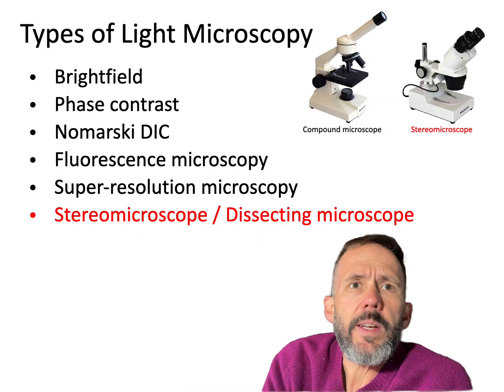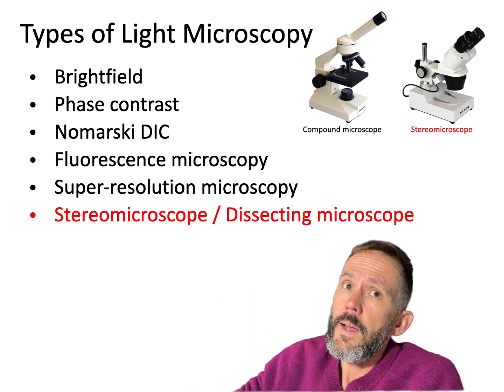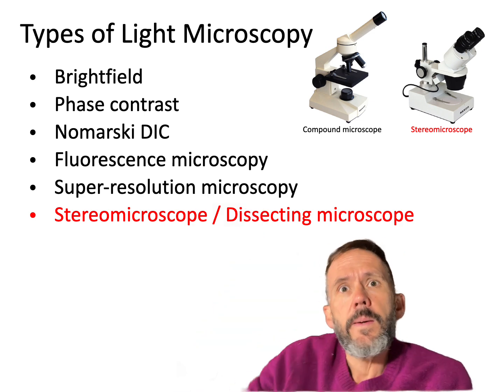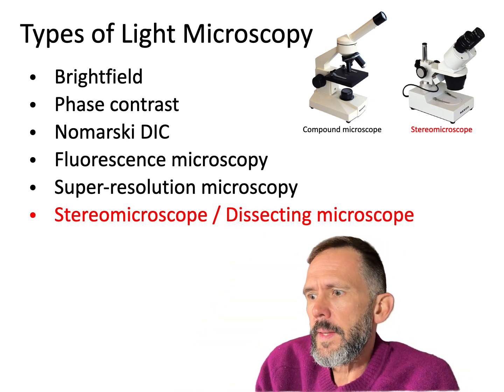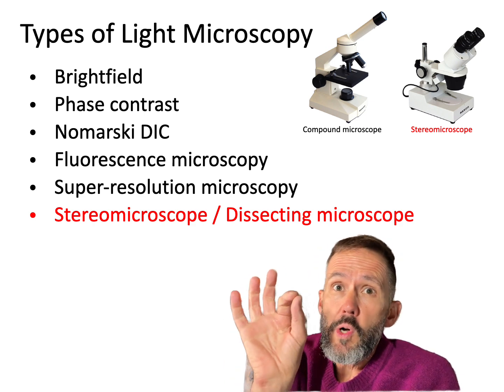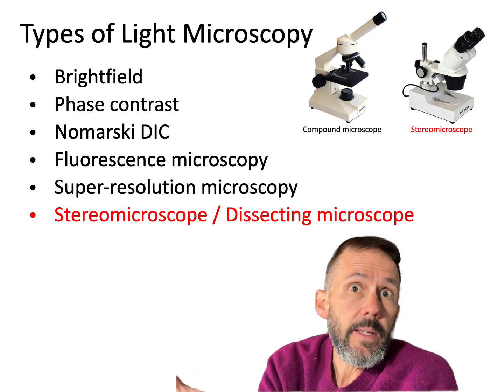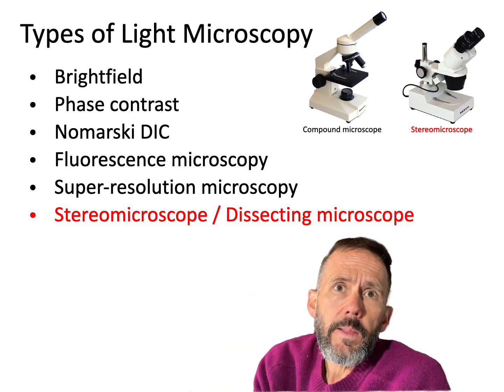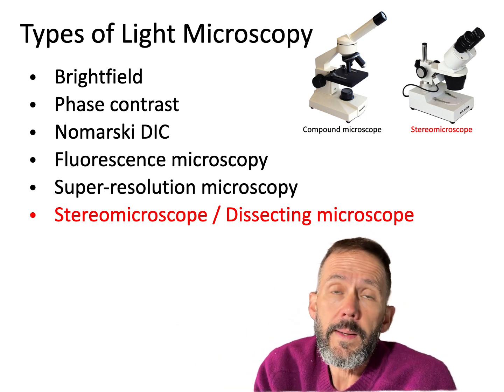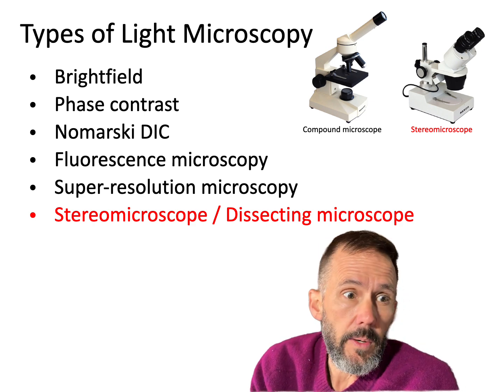So we can look now at some of the different types of light microscopy, right? Light microscopy uses lenses with light passing through the lenses to influence the path of the light, and in that way gives us this idea of magnification, magnifying something that's below what can be perceived with the unaided eye into something that can be perceived. There's lots of different flavors of light microscopy. Bright field is the one that we've all used, right? That's with a standard compound light microscope.